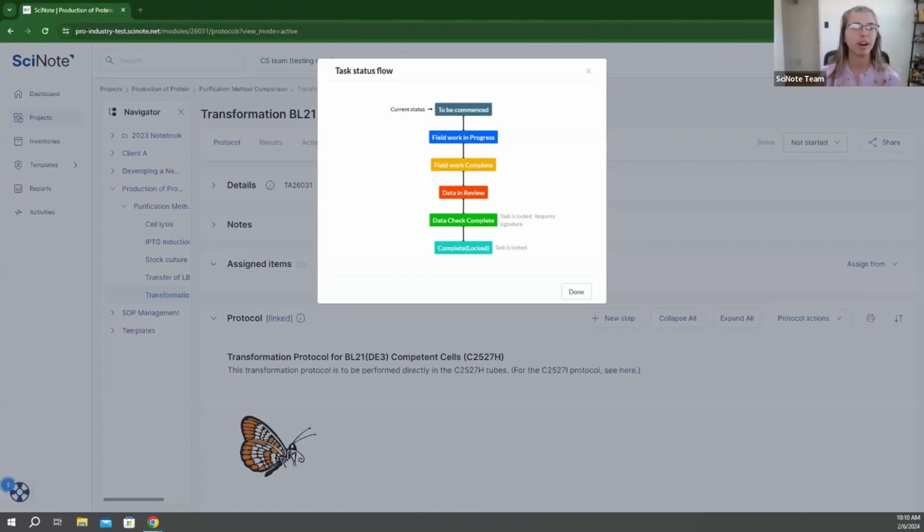And as I mentioned before, you can even choose when you prefer to have your snapshots be generated. It doesn't have to always be generated at the in review stage. Maybe you want to wait till the end. Maybe you don't want your task to be locked yet because you want to make changes until you move it to done. All of these can be feasible based off of what you're looking for and what your team needs. The flexibility, honestly, is up to you to define. That's just where we come into play, and we can help that become a reality.